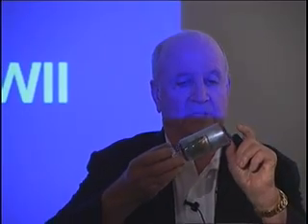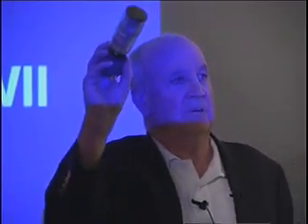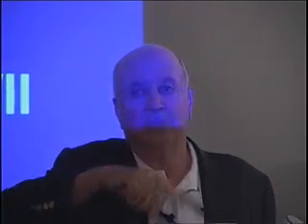We're going to talk about the crystals at the end. That flash of light is picked up by this photoelectron multiplier tube, and it registers based on the energy, the height of a peak. So it makes a spectrum from which one could detect fallout. One could detect, in fact, whether somebody had been in the vicinity of Chernobyl. So that was the last use of it, in fact, was in the 2 years after Chernobyl, to see if we could track those people that had been exposed and at the same time track where the radioactivity had gone.